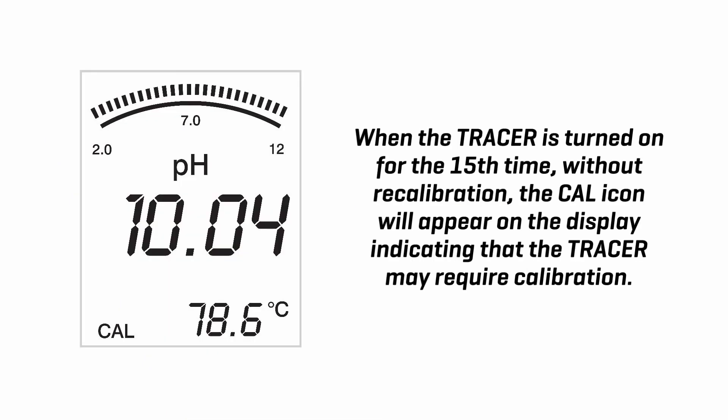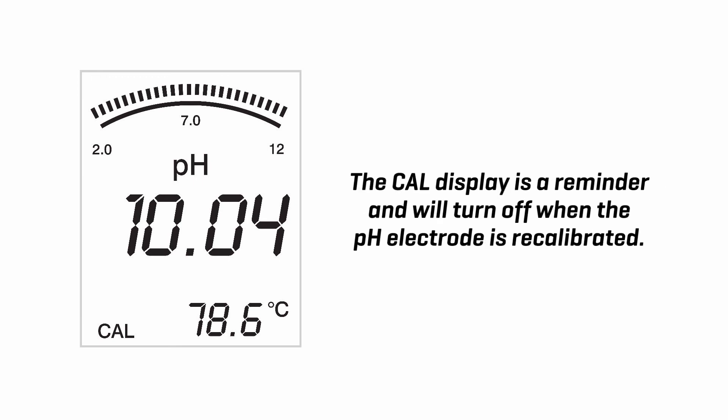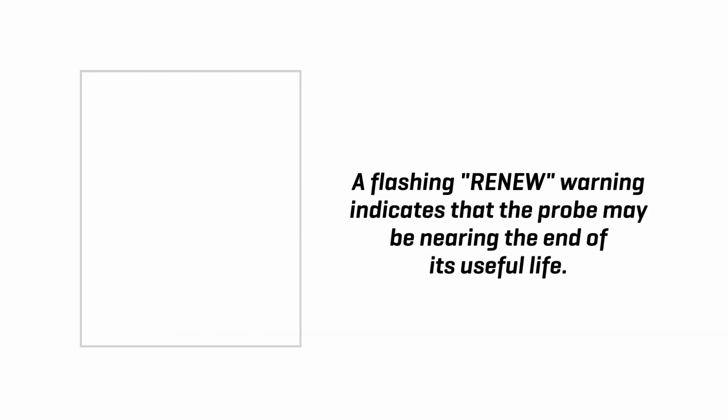Display messages. When the tracer is turned on for the 15th time without recalibration, the Cal icon will appear on the display indicating that the tracer may require calibration. Some applications may require recalibration of the electrode more frequently than others. The Cal display is a reminder and will turn off when the pH electrode is recalibrated. A flashing renew warning indicates that the probe may be nearing the end of its useful life.